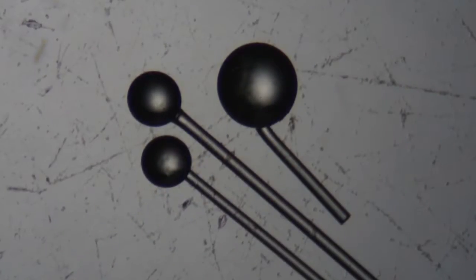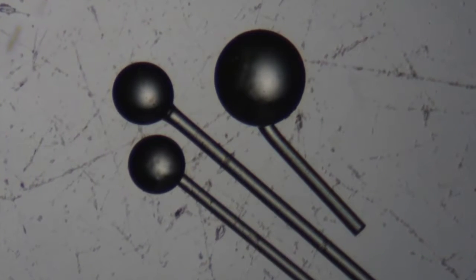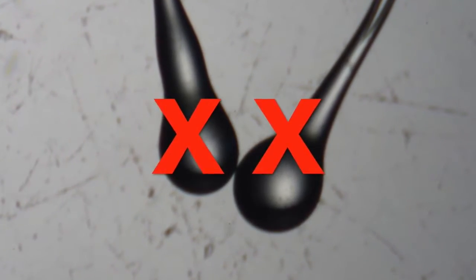Under the microscope it should look like this, a lollipop of glass with a sphere connected to a thin stalk. You should not get a teardrop shape. This won't work very well.